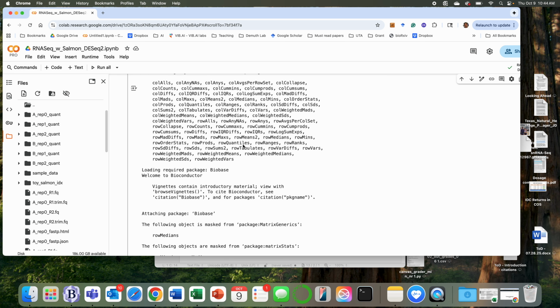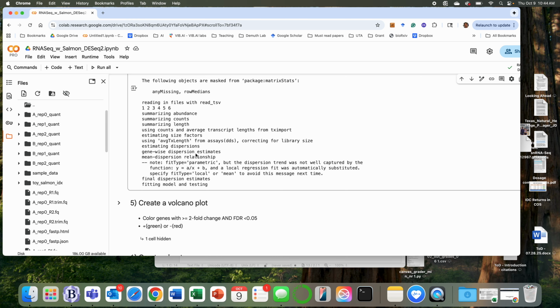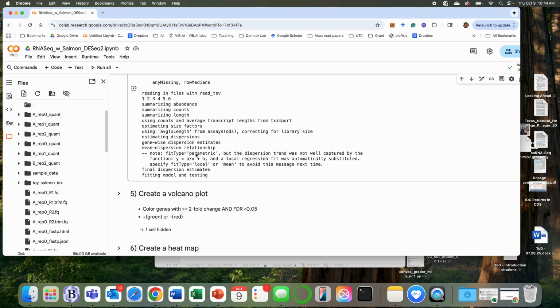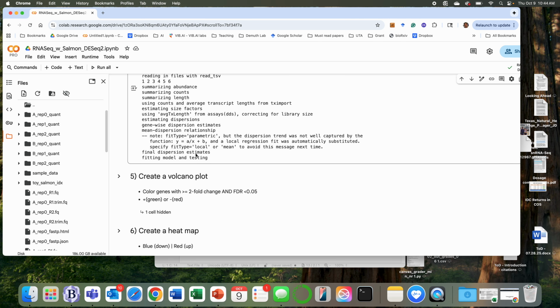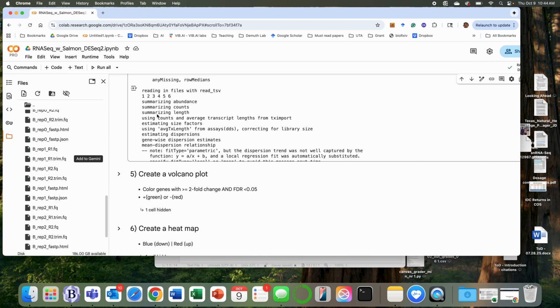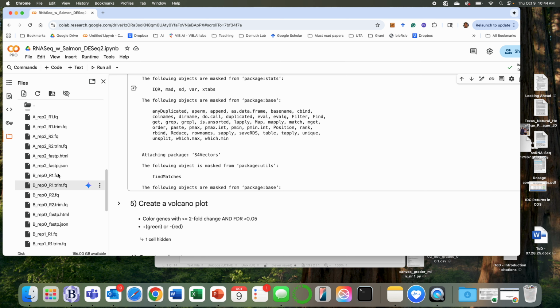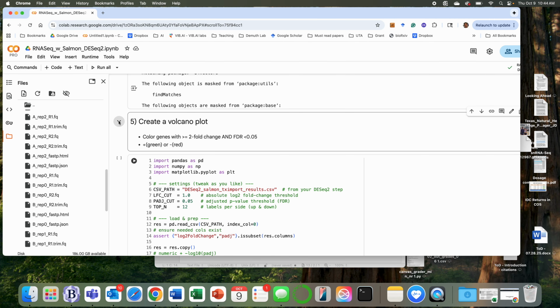Okay, so the output of that cell, that's what, if you were running DESeq in Galaxy or on its own in an RStudio session, you would see the same thing. It's not actually telling you which genes are up and down regulated, but it is generating the... actually, did it finish? Yeah. Actually, I'll show you because this will read that file.